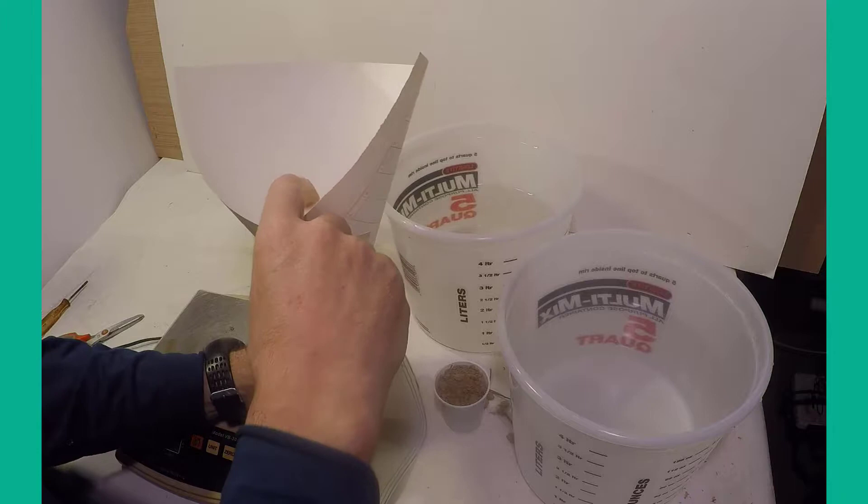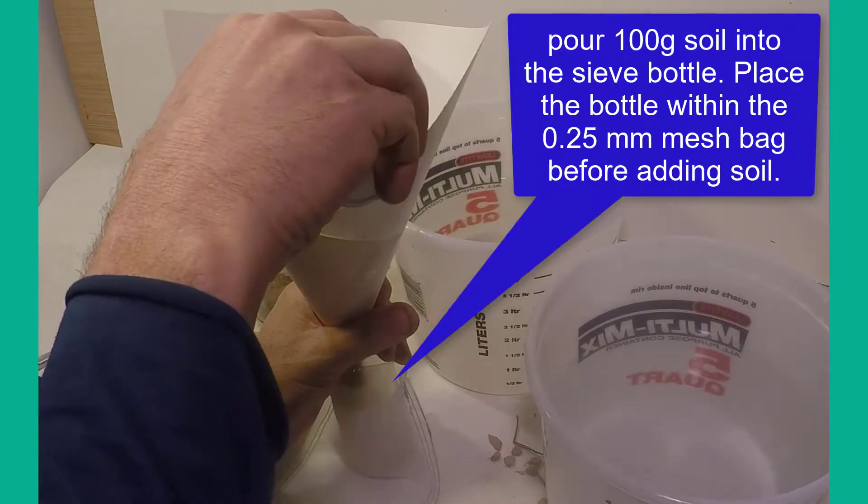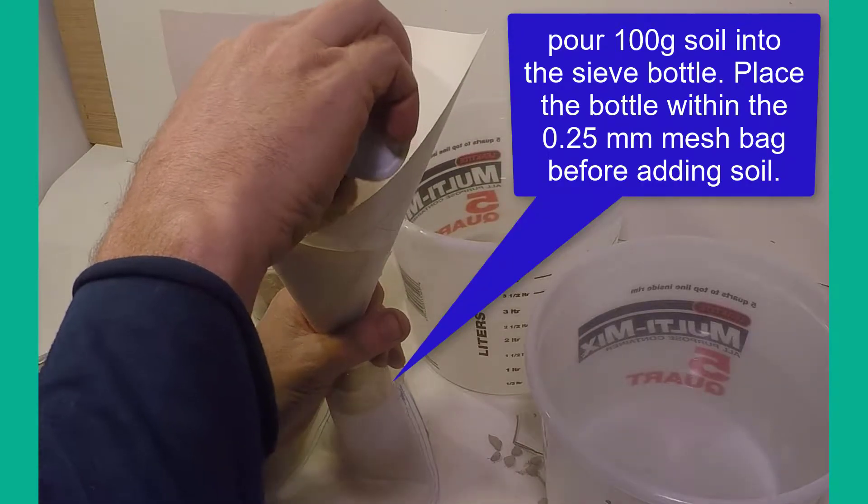Next, the 100-gram soil is poured into the sieve bottle, with the sieve bottle already inserted into the bag.